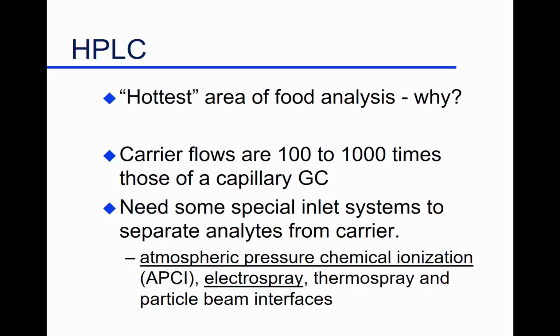So we have to have special systems for that. We do have an opportunity of analyzing air samples, and we do make use of measuring air samples in our field by mass spectrometry. In that case, we're just drawing air in from someplace, the environment or wherever, into the system. So that's a fairly easy one. When we get down to other techniques where we're pumping liquids, then we do have these types of techniques. When we use a mass spectrometer in my laboratory, it's very commonly one where we're measuring what you breathe.